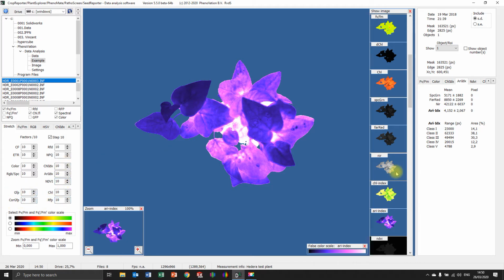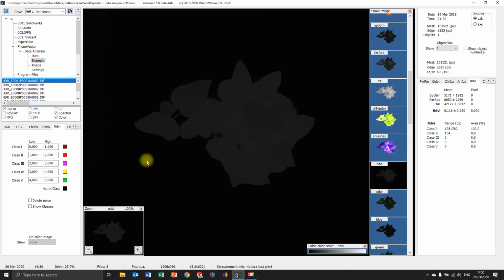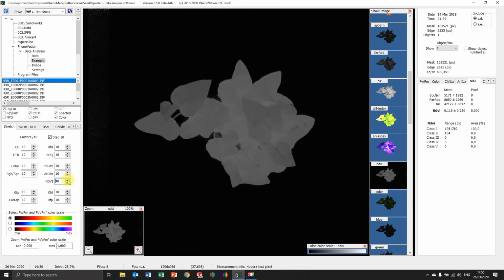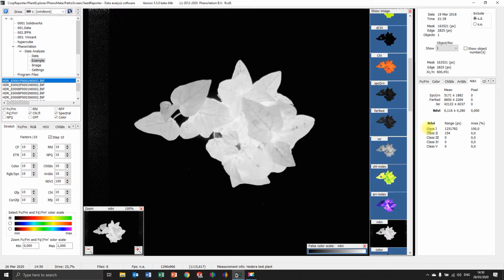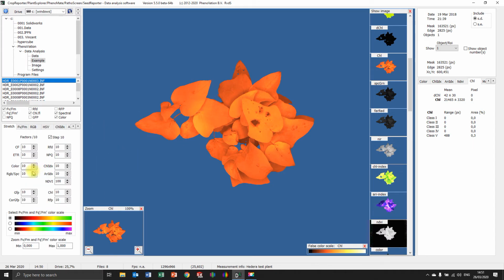But now you can see, for example, NDVI. Let's go to that one. Let me see where it is here. It's pretty pale. And if you want to say, well, I want to increase it a little bit, okay, we can do that. Increase it by 100 times. And you have a better visual image of the NDVI. So still, it won't affect the data, but it will only visualize a little bit more of the image to make it prettier, or to visually see the damage better.